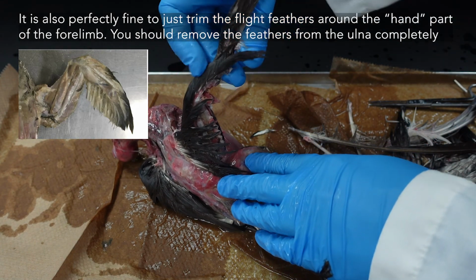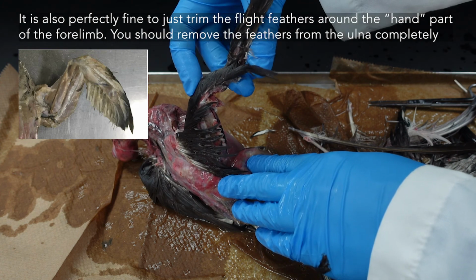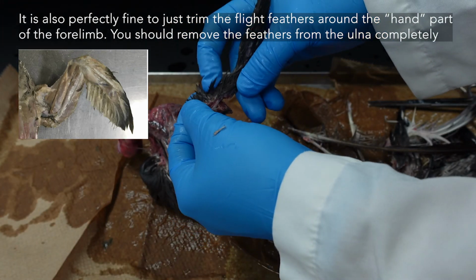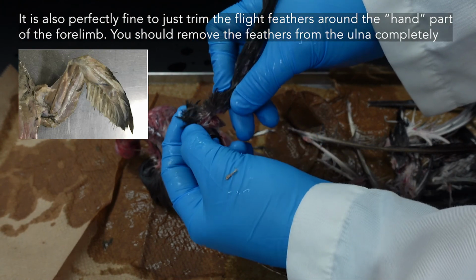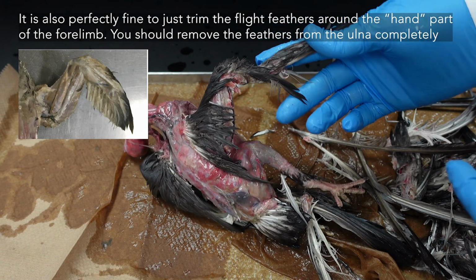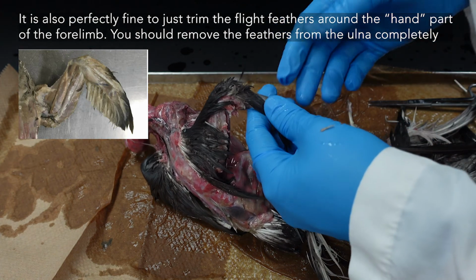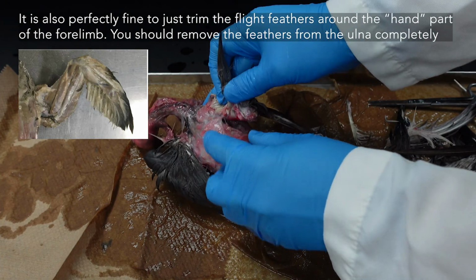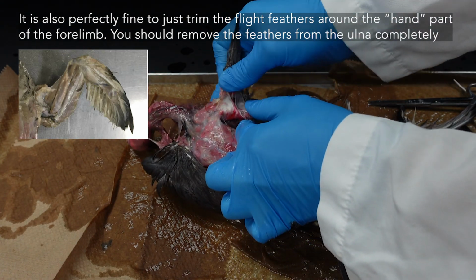There is an alular bone here, the thumb bone of the bird. So you want to just be careful about that, so you don't accidentally rip that off. It'll be just a little bitty stub. If it does come off, it won't actually hurt anything. So you don't have to be that careful, but it's kind of cute to see it in place.